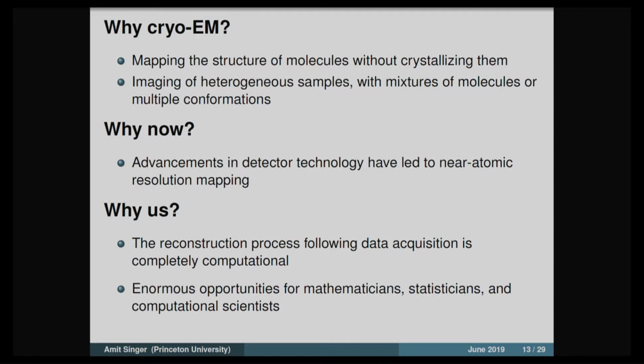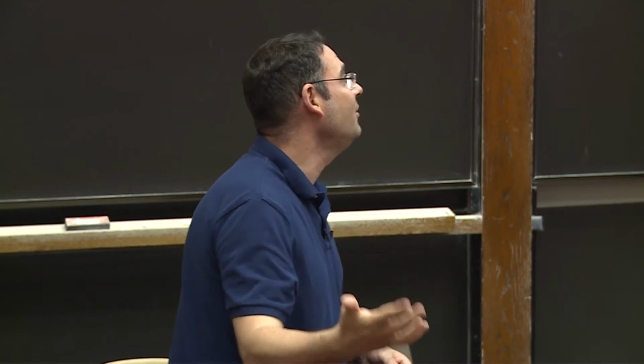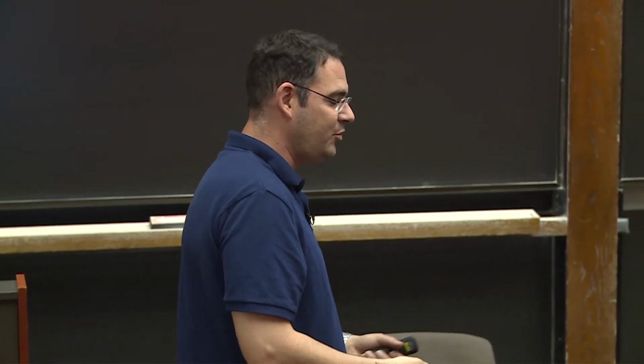Whereas in NMR and, say, in crystallography, this is a much more complicated task because the signals that you measure come from the entire aggregate of all the molecules in the water solution, let's say in NMR, or all the diffraction patterns correspond to all the molecules in the crystal. And even the crystallization process itself usually prefers one conformation over another just to get the molecule to crystallize.